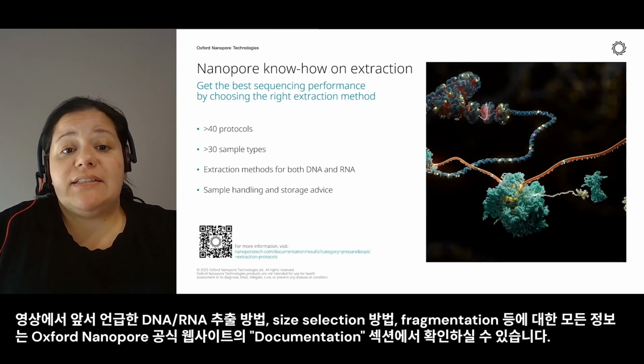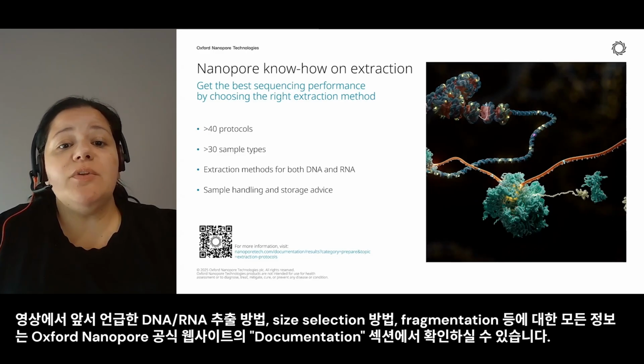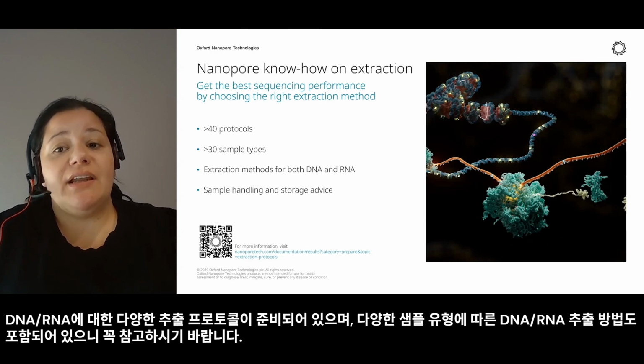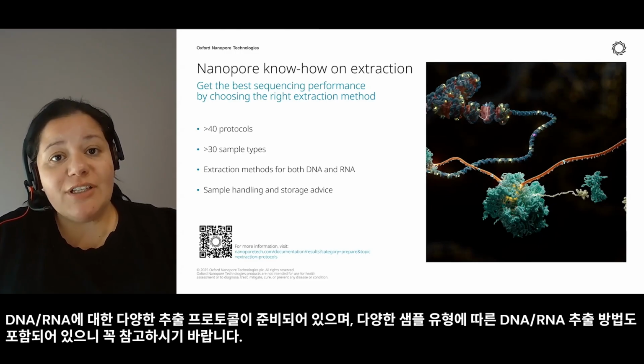Information on all the things I talked about during this presentation, so the extraction methods, size selection, fragmentation, and more, is available in the documentation section of our website. We have a lot of extraction protocols for both DNA and RNA, and a lot of sample types are covered. So please do go there and explore.